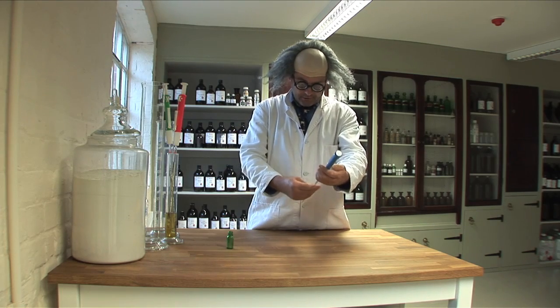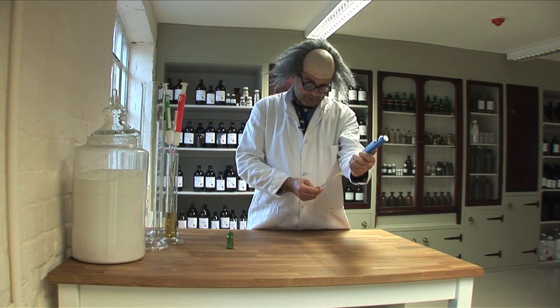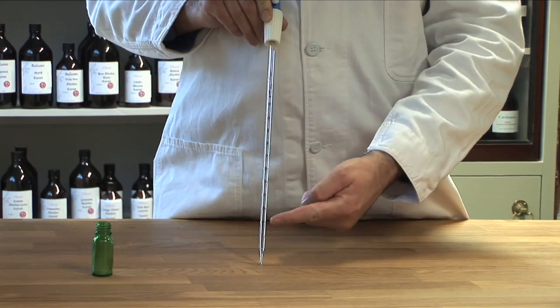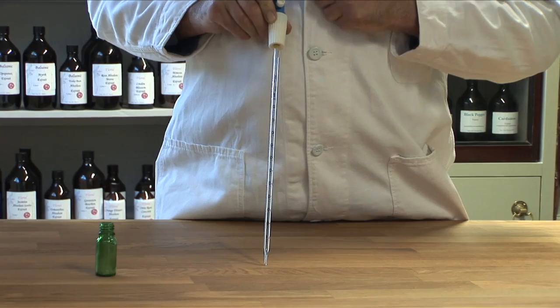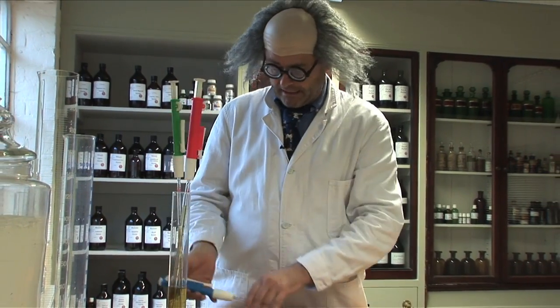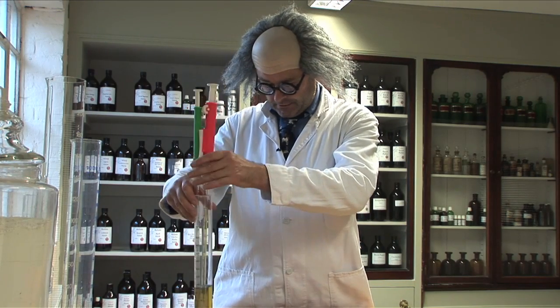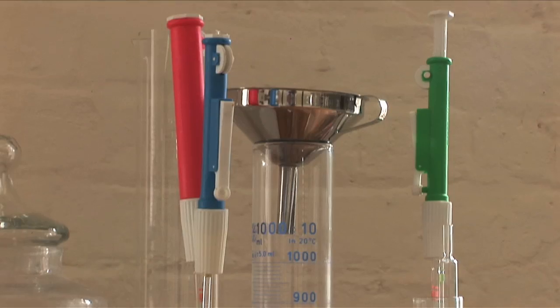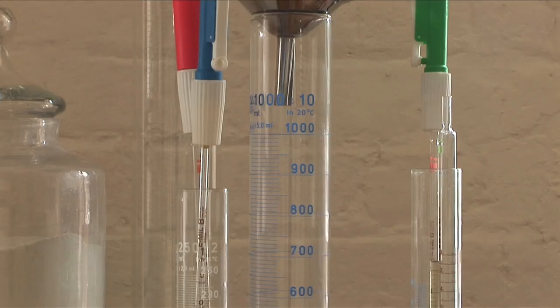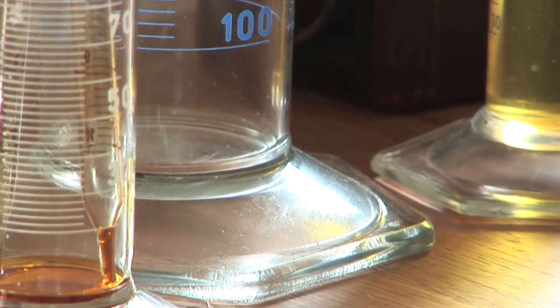The important thing is that where the graduations are should be facing you. The graduations need to be in line with this lever here. I usually keep my pipettes standing upright in a measuring cylinder — as you can see, there are various sizes of measuring cylinder here and they've got a good stable base.